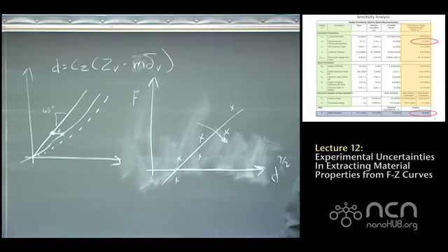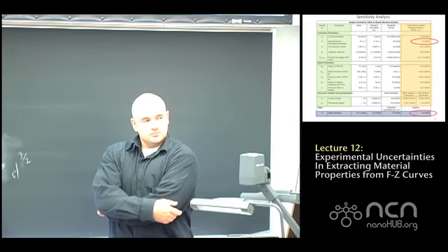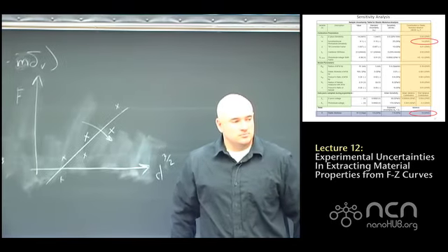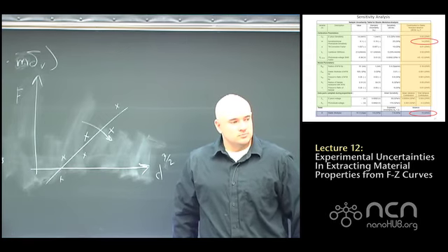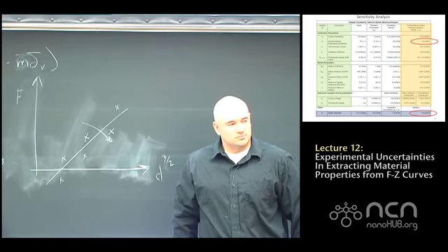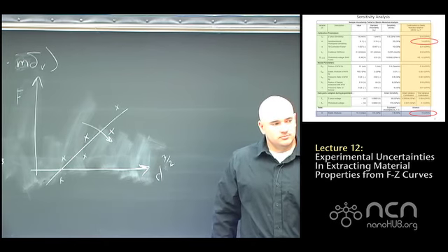So the key point is, for many materials, when you do force curves on a calibration surface, a really hard surface, we expect this 45-degree line, and you do it on most materials, polymers included. The F-Z curve you get on the polymer is not going to be very different from the 45-degree line. It'll be a small change, and then when you do the F-Z to F-D conversion, you're basically subtracting Z and delta. Delta is due to deflection.